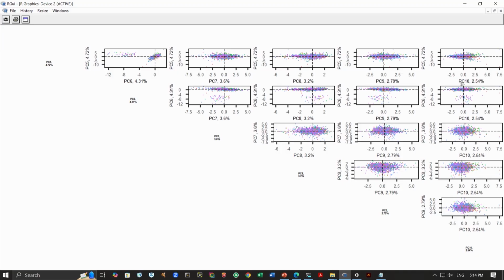What is interesting, as you can probably notice here now, is, for example, PC5, PC10, right. It's kind of separating out these green and orange things. So you can see these green clusters above here and orange clusters below here. So this is interesting, because if we want to separate out these clusters, it means PC5, PC10 might be the most informative principal components.